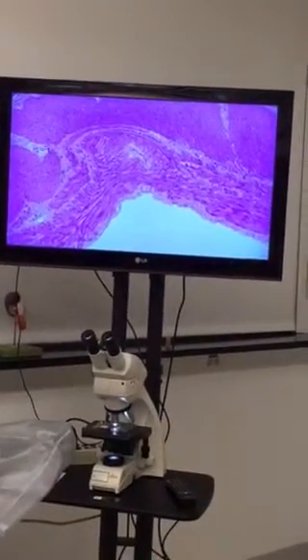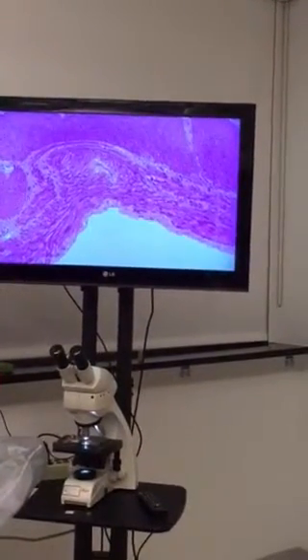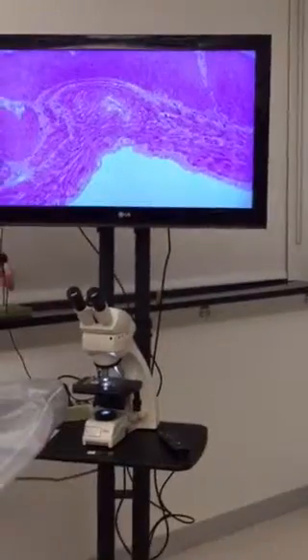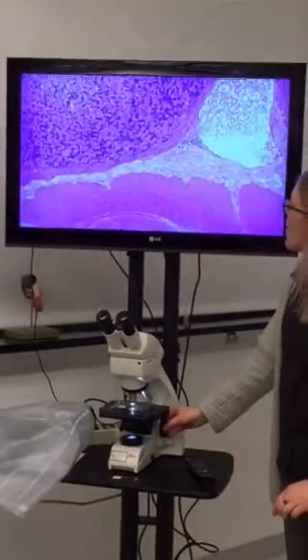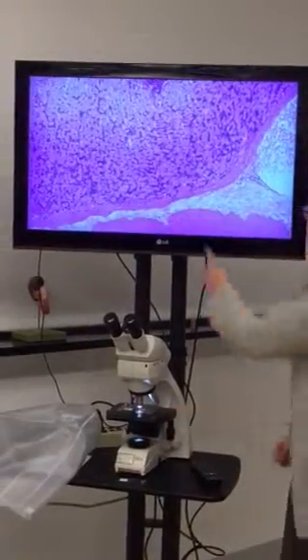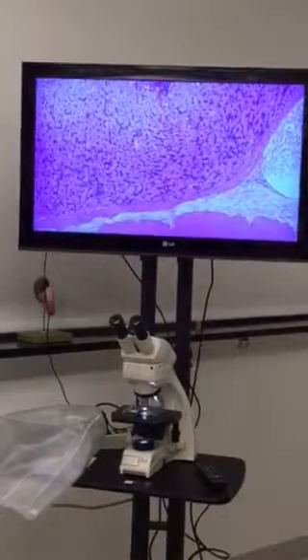On the exam, I could ask for the layer. Make sure you know what the smooth muscle layer, the muscularis externa, looks like. If it is just a few layers of cells, it has to be that muscularis mucosae, the smallest one.